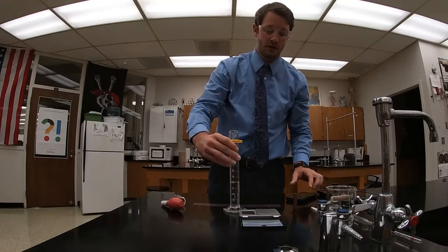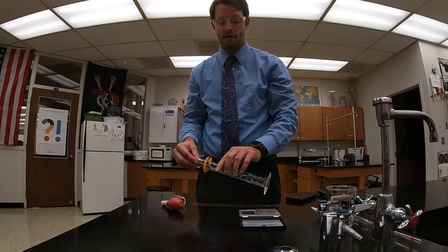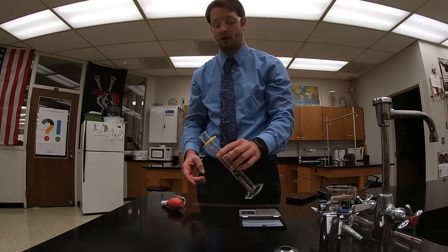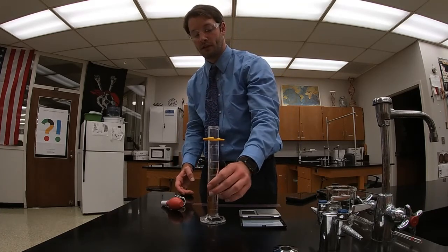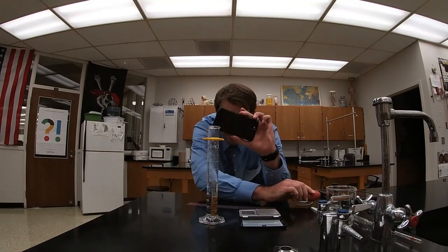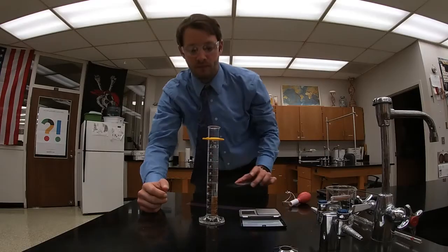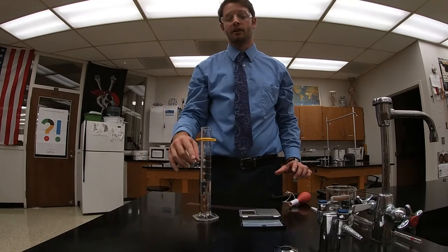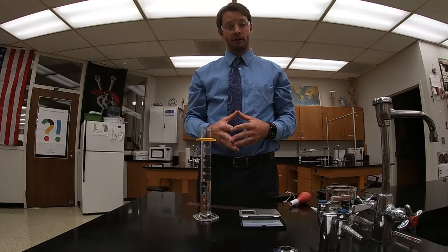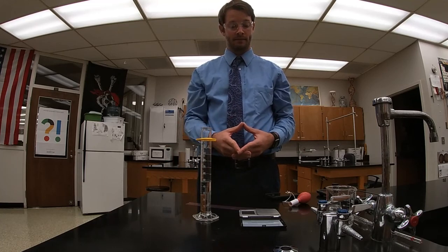Once I submerge the cylinder, I want to be careful I don't crack the bottom. The water level will rise, and the amount that the water rises will be the volume of the cylinder. So take the volume after, subtract the volume before to get the volume of the cylinder. That'll be in milliliters. Again, calculate the density using the mass. That's it.